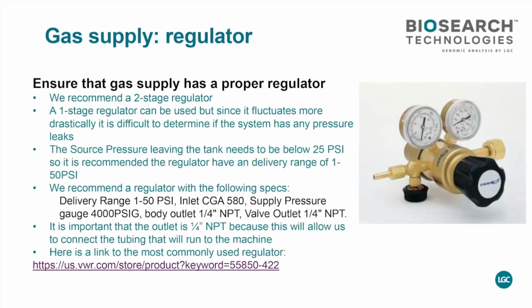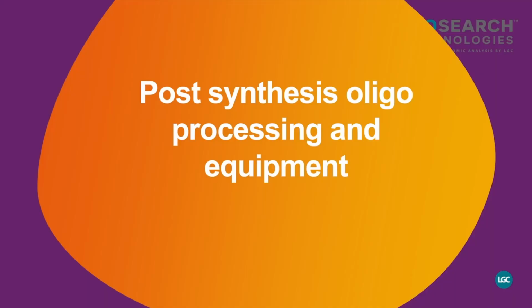You do have to purchase a gas supply regulator. They're available pretty much everywhere. That's going to control your gas flow from the gas cylinder into your instrument. So that's for setting up the instrument.